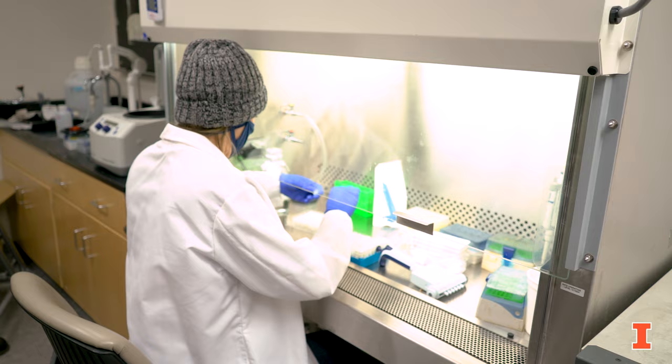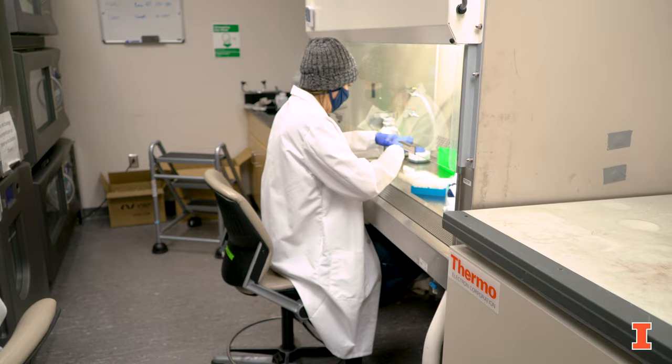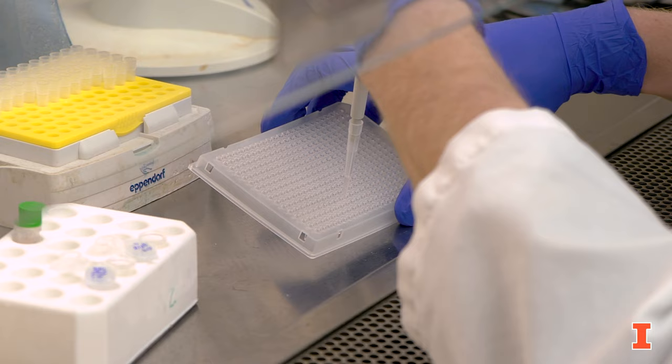In this room we have two biosafety hoods and also five incubators that are responsible for growing up all of our microbes that we experiment on. This is where a lot of the cell work actually takes place for people working on yeast and bacteria. In the room adjacent to this, people work on mammalian cell cultures.